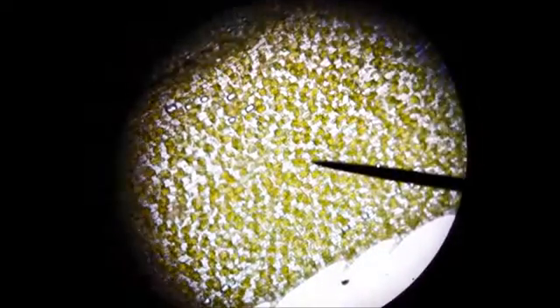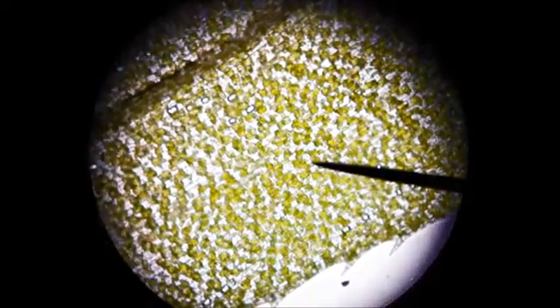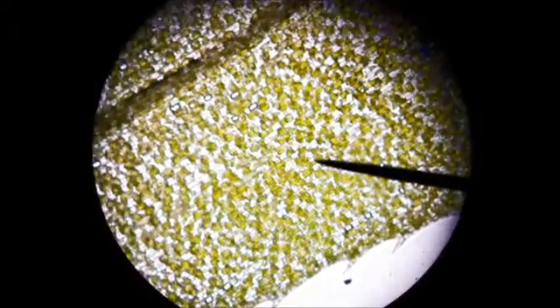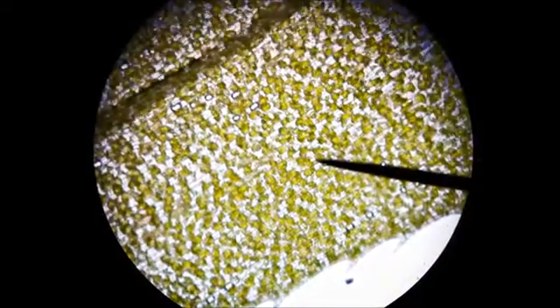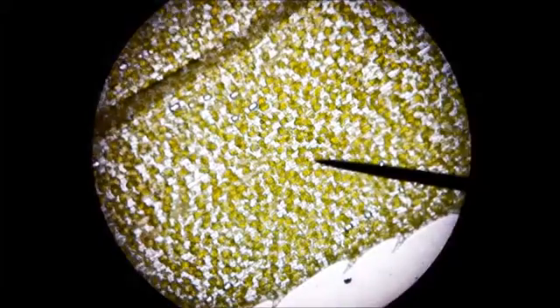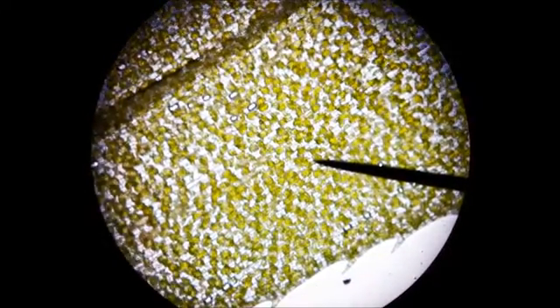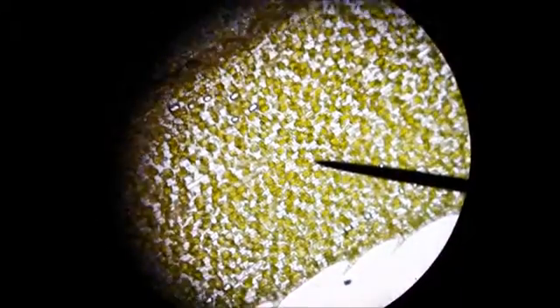In a hypertonic solution, the insides of the cells just collapse and all the chloroplasts clump toward the middle. What you can see here is not much fluidity, but just big clumps everywhere.